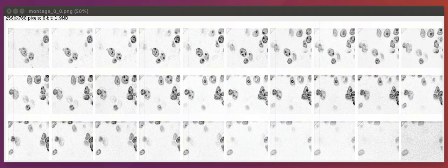To do this, you can make use of the intensity profile that we would expect from sectioning a three-dimensional sphere into two-dimensional slices. Specifically, what we would expect is, starting from the bottom and going up, we'd expect an object to start being small and dim, then bigger and brighter.